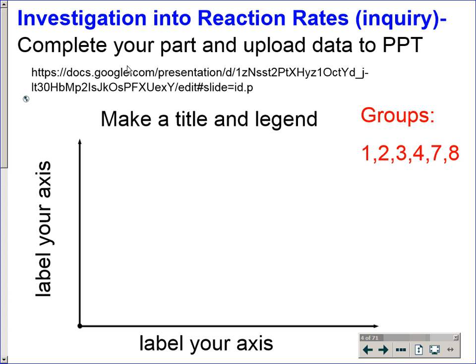After you do that, you're going to graph the data. Your data should be very specific to your experimental variable, your independent variable, your dependent variable. Remind each other what that is right now. All right, you should know what IV and DV is referencing in general in experiments.